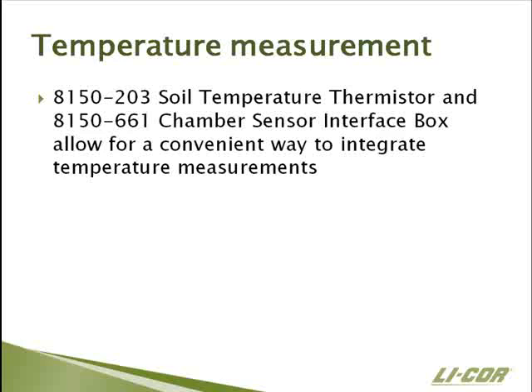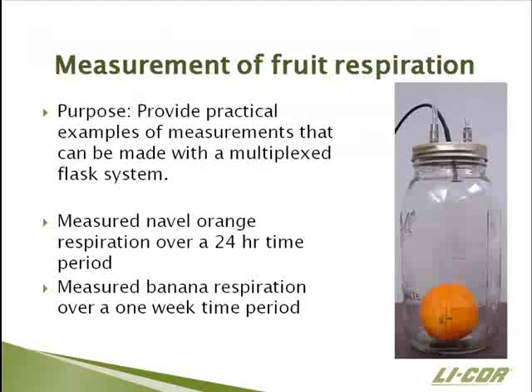So these are thermistor-based temperature sensors, so they have a relatively significant thermal mass to them. And so if you have rapid oscillations in temperature, you're not going to detect that with these sensors.